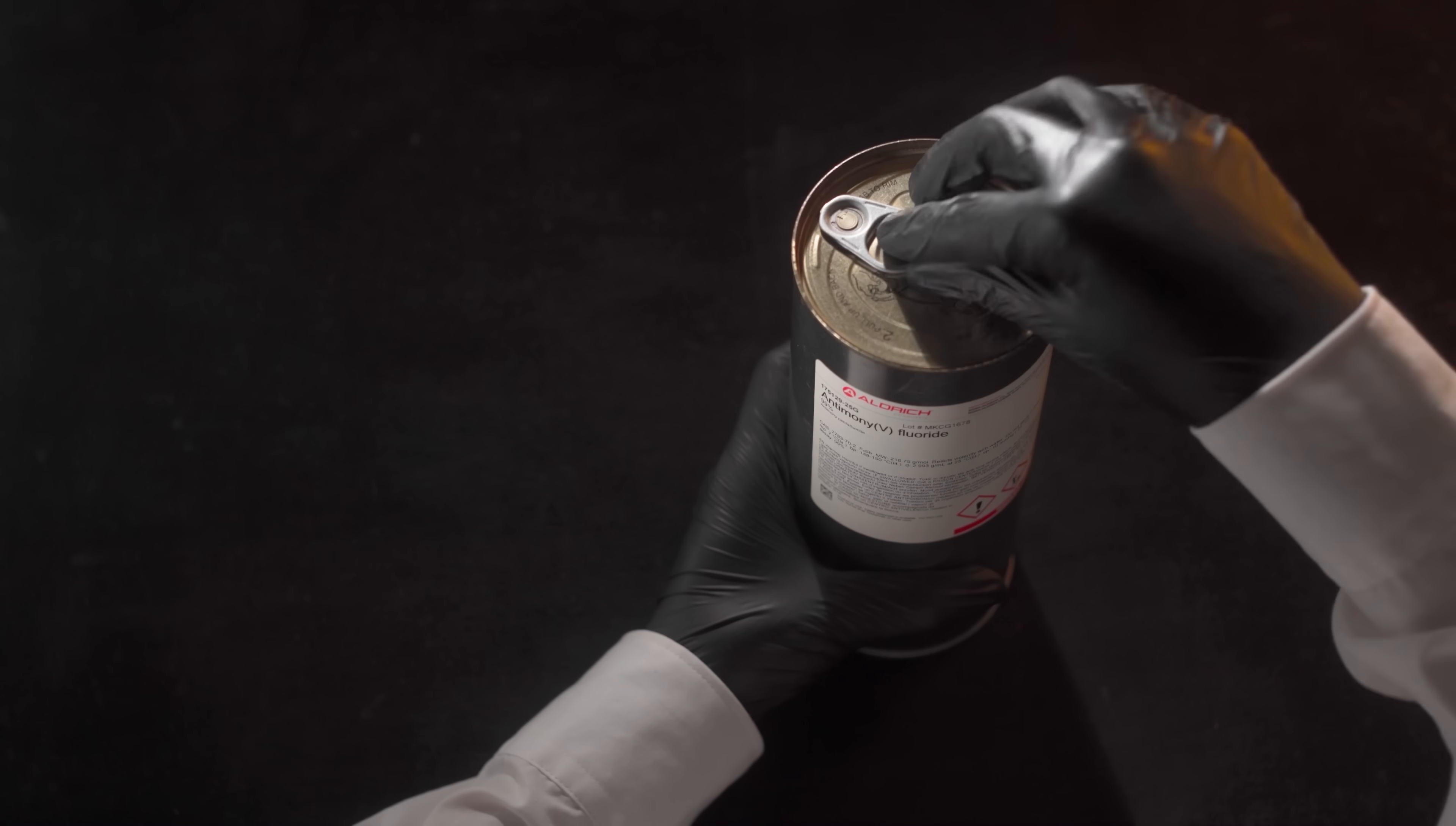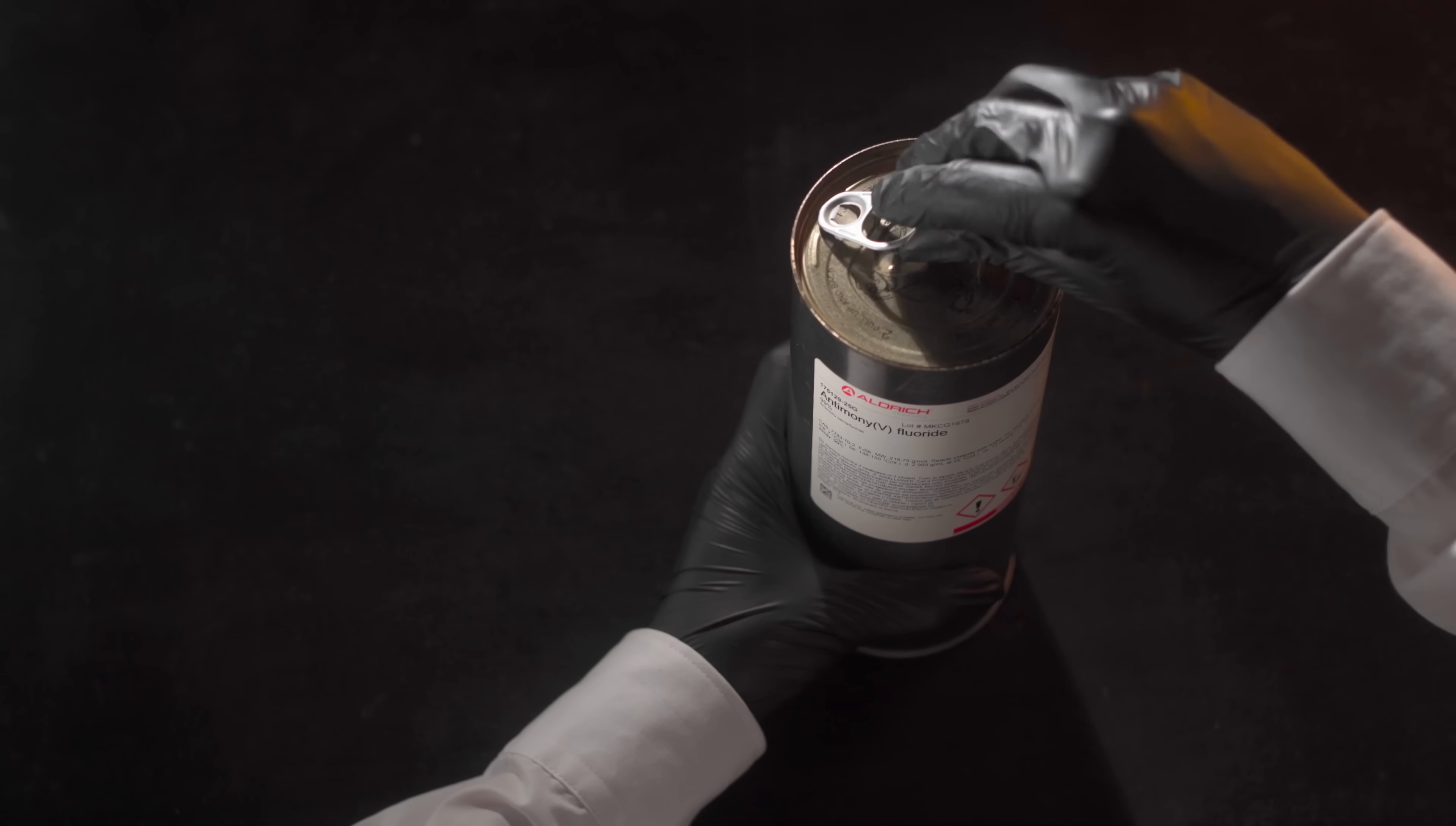The second component of magic acid is antimony pentafluoride.